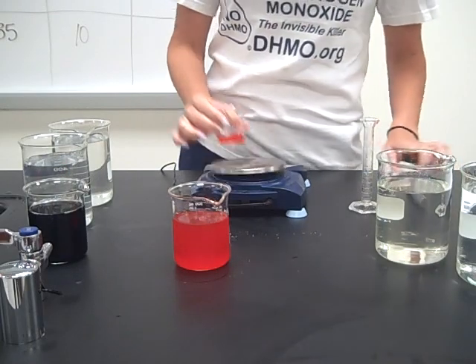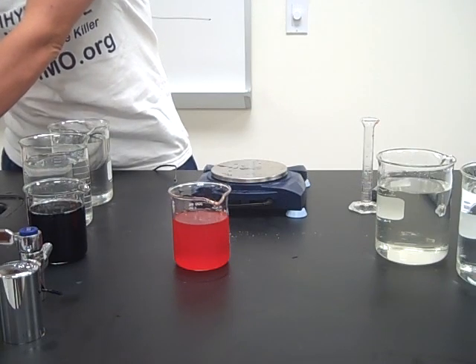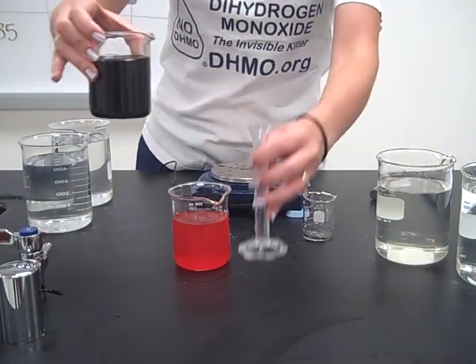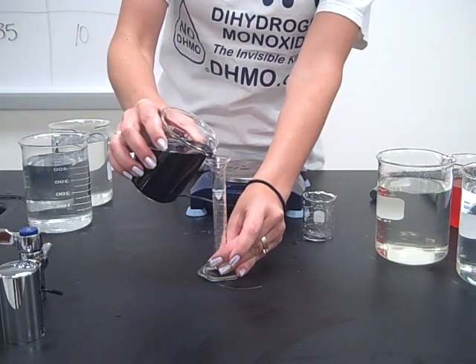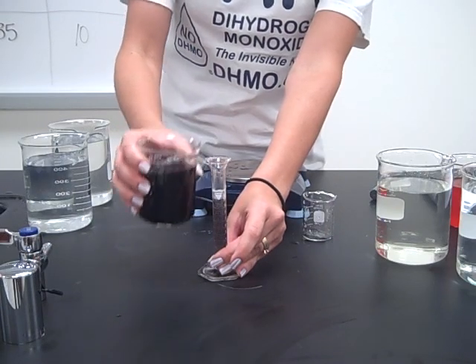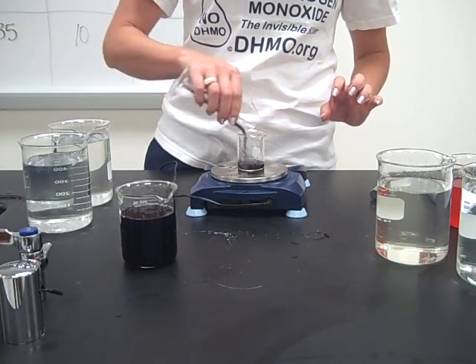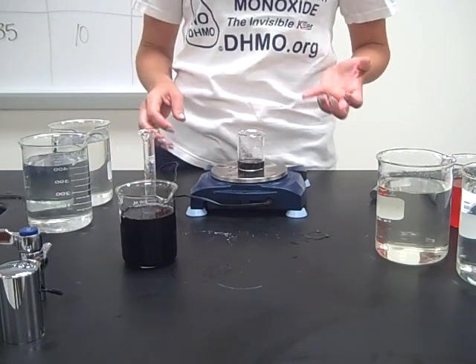Now I'm going to rinse it out and do the next test solution, which is smelling really yummy right now — grape soda. Same thing, 10 milliliters — very boring procedure to watch on a video, I know. Measuring that out, zeroing this out before I start, and in we go. On this one we have a mass of 10.25.